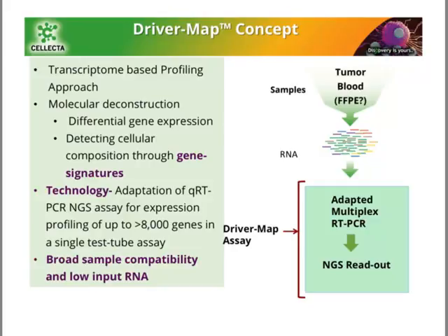There are two components that we wanted to focus on, not only the differential gene expression, just getting an idea of either your set of genes or a genome-wide approach, but also looking at detecting cellular composition through gene signatures. So this is just giving you a concept, and I'll walk you through some of the validation and how we've looked at it.